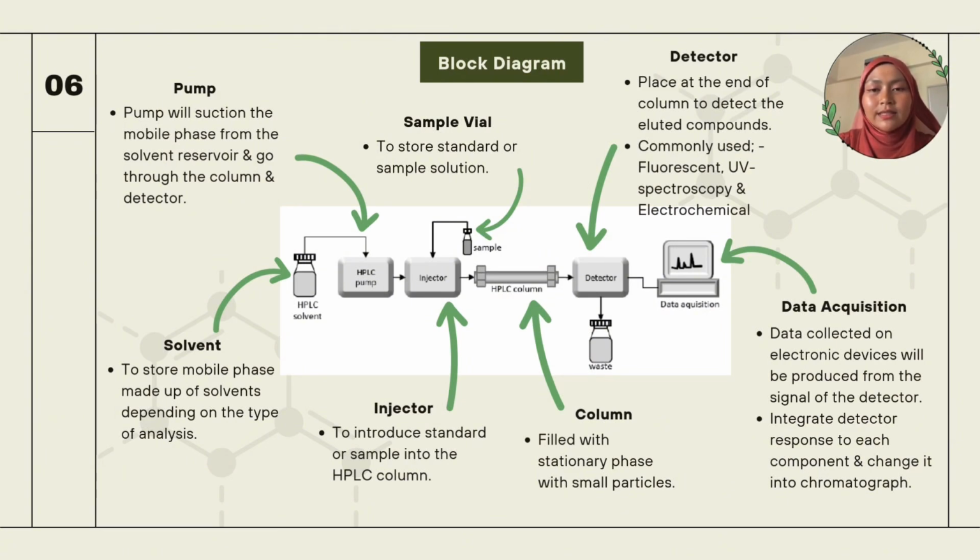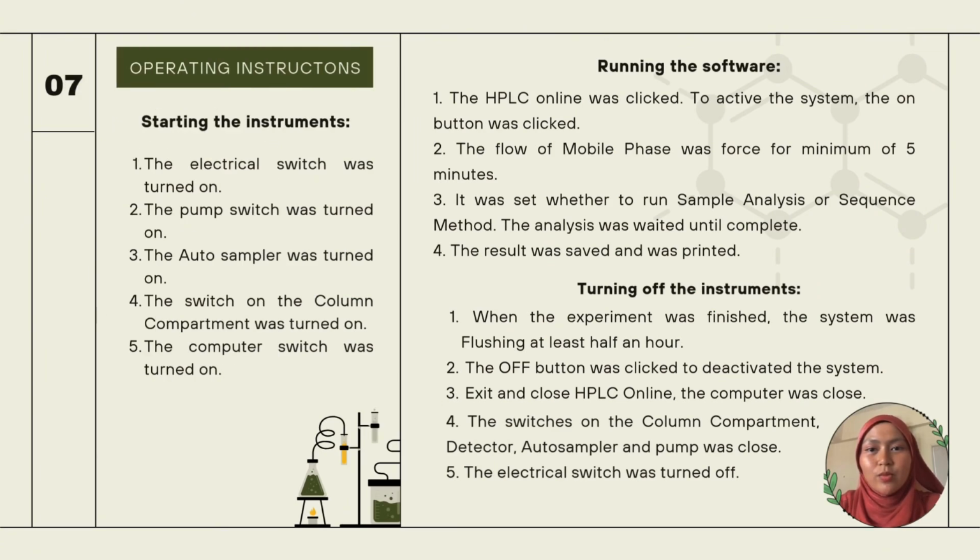And then it will integrate detector response to each compound and change it into a chromatogram. For example, data acquisition could be a computer, laptop, and printer. Now we move to the operating instruction.